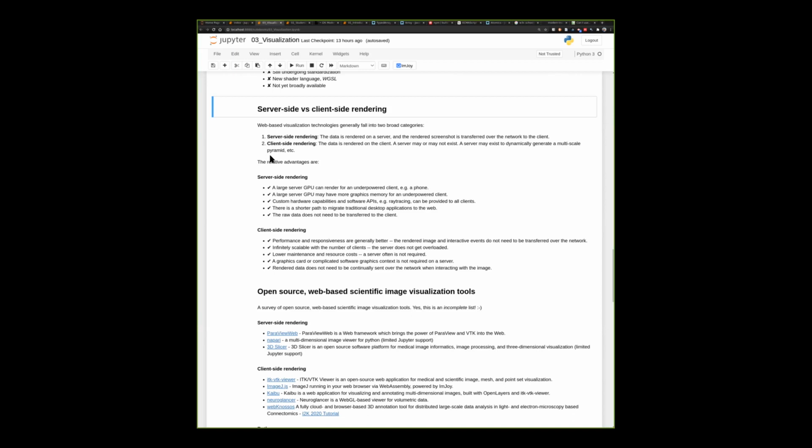So the underlying data is sent. That might be the samples from the microscope, and that data is sent in some form from the server to the client. There might not be any explicit compute server available at all. It might be just something that's providing data, or a resource that's providing data.